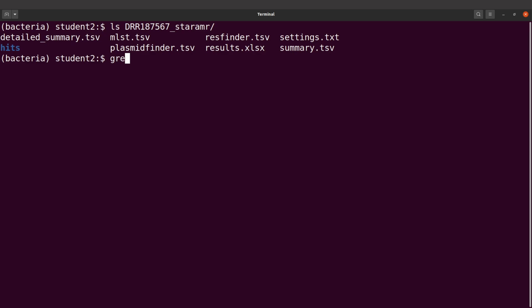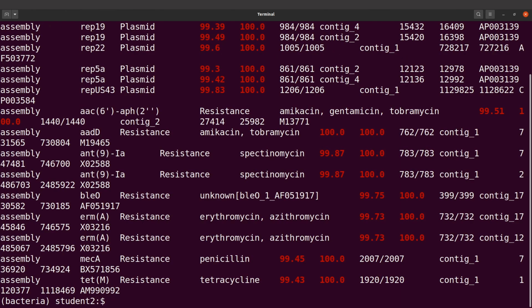All right, so I'll use grep and I'll say -P, and the -P here means I'm going to use the Perl style. I'll bring my quotes and then I'll paste the pattern there, and then I'll bring another quote again. They are all single quotes, and then I'll specify the file. So this will be the final command. We need to redirect the output to a file, but for now, let's just display it. So let's hit enter, and then we have the results here.